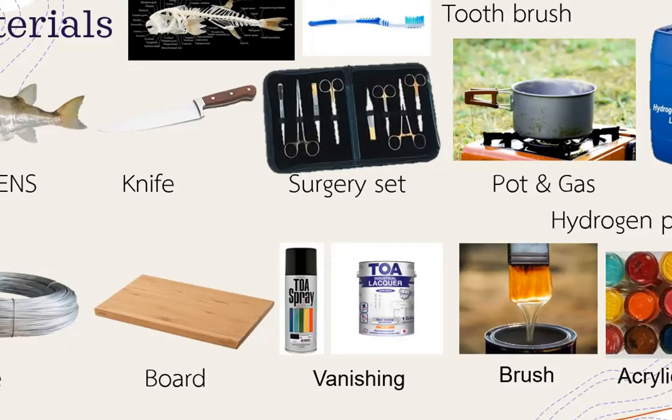Your useless book, you can use it to fix the fins, because if you don't fix them, they become curved, and many curves are not a good condition. If you want to take it back, you put them in water at room temperature, and when they become softer, you can adjust them and fix them with the thick paper. And also another thing is hydrogen peroxide.